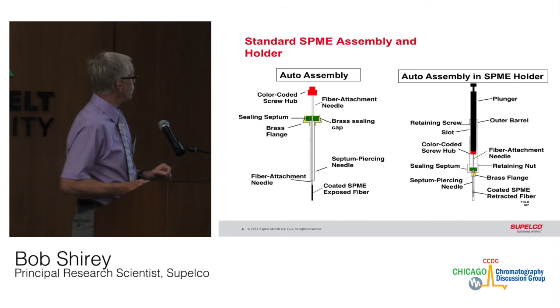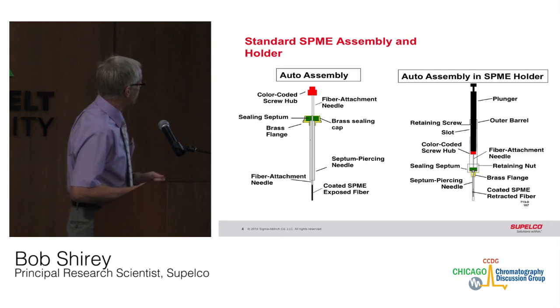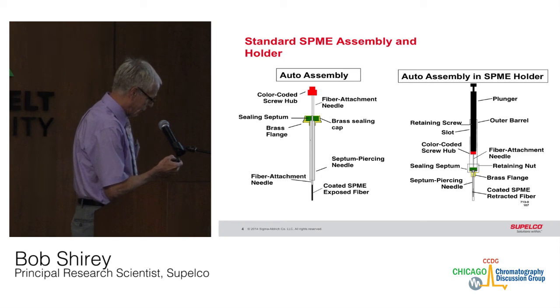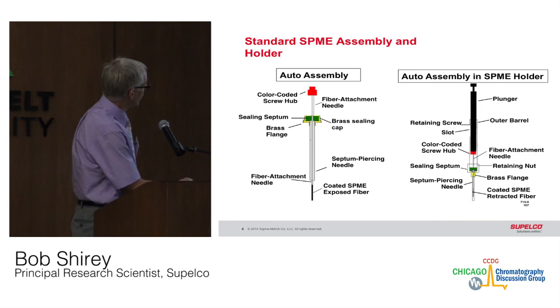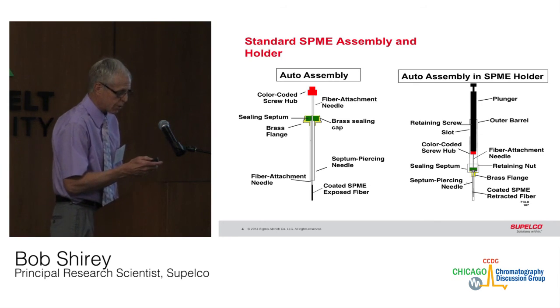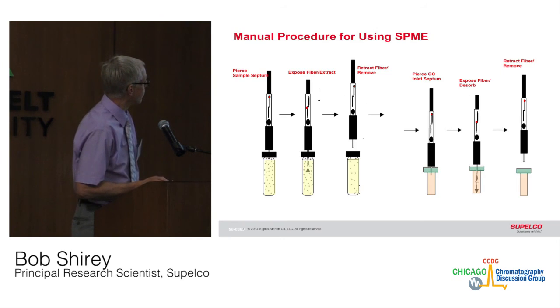Basically, it consists of two components, a fiber assembly and a holder to control the fiber assembly. The fiber assembly consists of two pieces, an outer needle and an inner needle. The inner needle has a coated fiber attached to the end of it, which can be retracted and exposed when the top color-coded hub is attached to the holder. This allows you to pierce sample septa and expose the fiber for sampling.